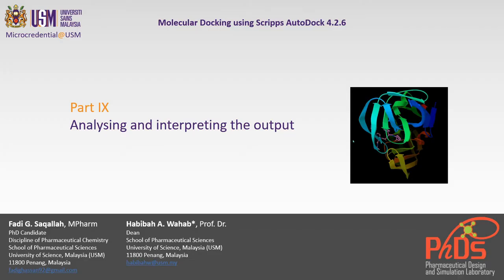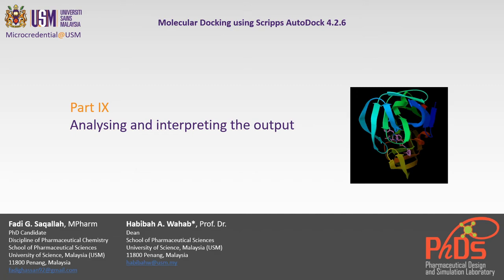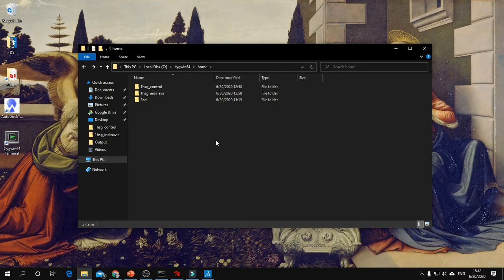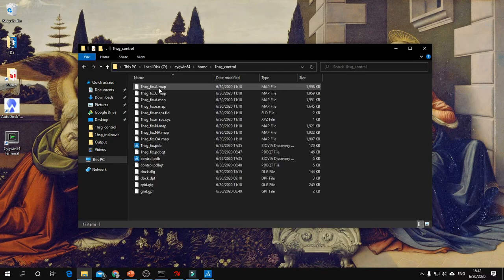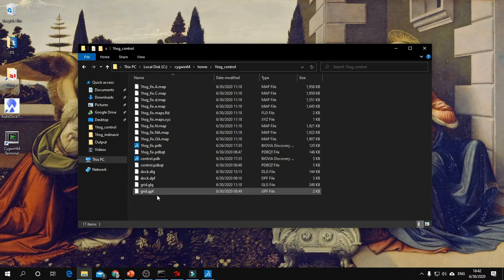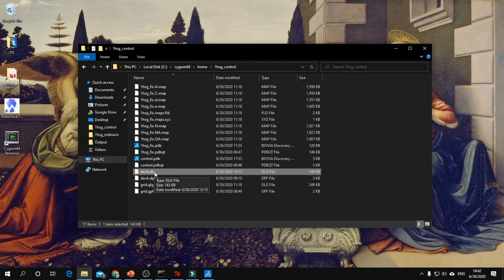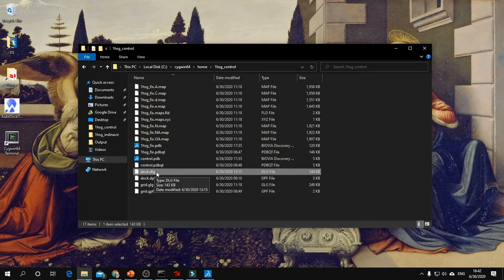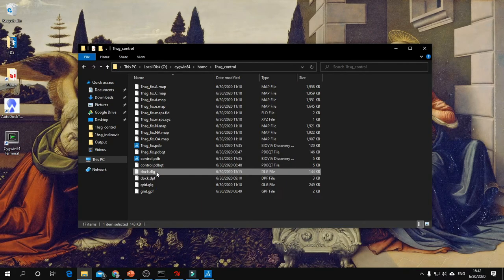Molecular docking using PyRx AutoDock 4.2.6, Part 9: Analyzing and interpreting the output. To analyze the molecular docking results and scoring function, go into the ligand folder and look for the DLG file, the log file of the docking procedure. You can open the DLG file with any text editor like Notepad, WordPad, or Microsoft Word.